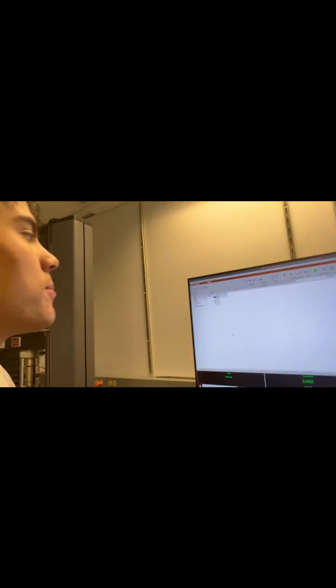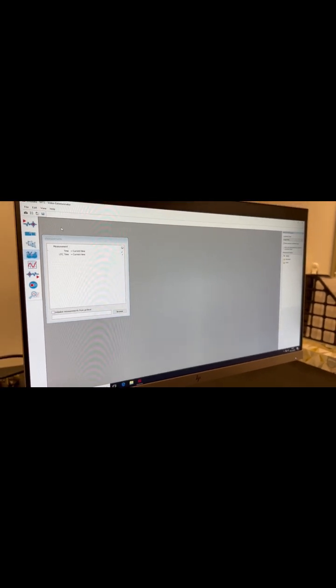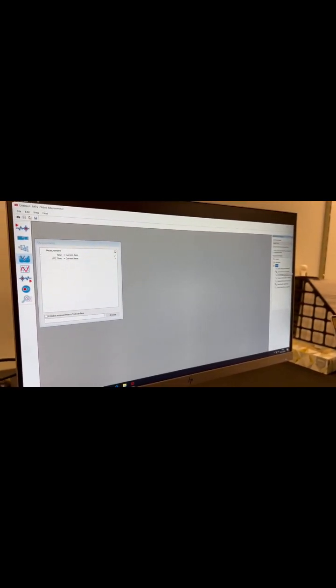Once the software is uploaded, we can adjust our test rate. For this first test, we'll be going at 0.1 millimeter per minute. We will be using the preset software data acquisition rate of 10 hertz. Open the MTS Video Extensometer software. So we're going to be measuring the strain of the extensometer.